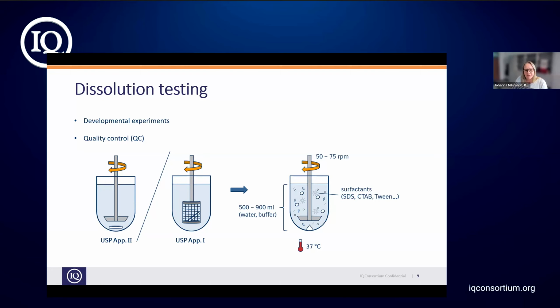So in general, as I guess most of you already know, dissolution testing is a performance test, which is used throughout development and also evolves depending on the stage of your development or formulation design. It is adapted throughout development with respect to the formulation design at that stage and also dosage strength. Next slide, please.